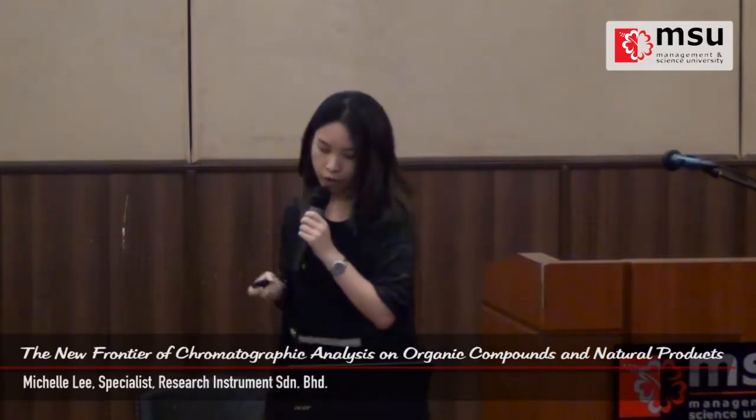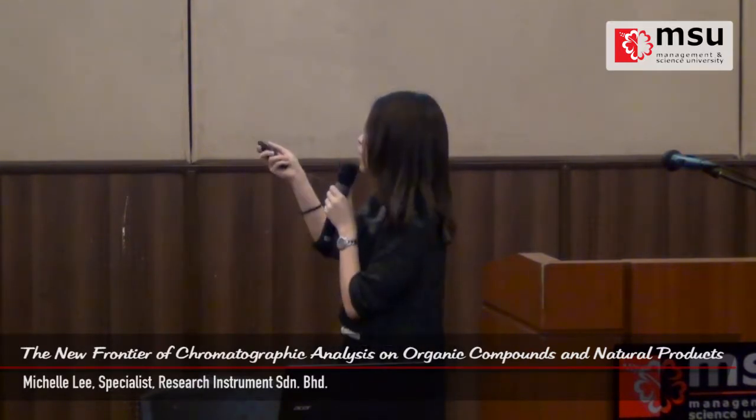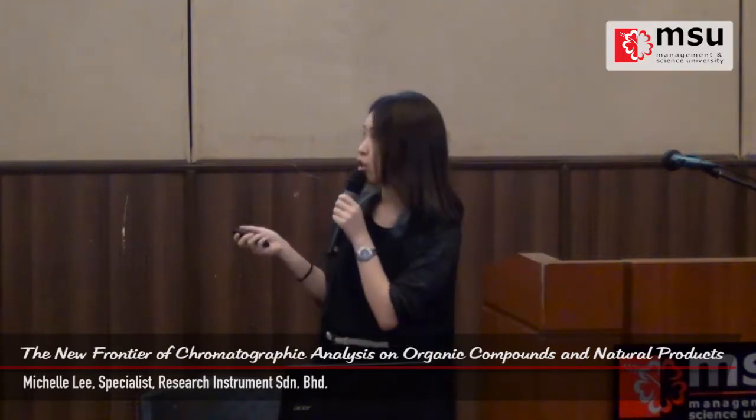Before going into the instrumentation, let me share with you some of the applications for TLC. TLC can be found in many various kinds of applications, and in Malaysia they are doing really well with botanical samples, herbal drugs, and natural products. Besides that, in pharmaceuticals, they use TLC for monitoring drug stability as well as impurities in their products. And in industry, they use TLC to monitor their chemical reactions at each and every stage.